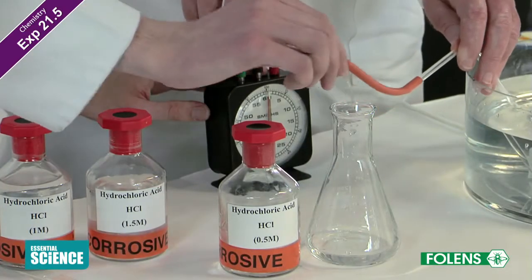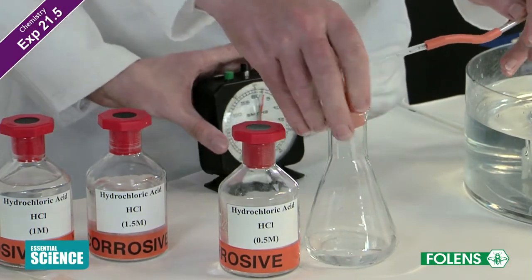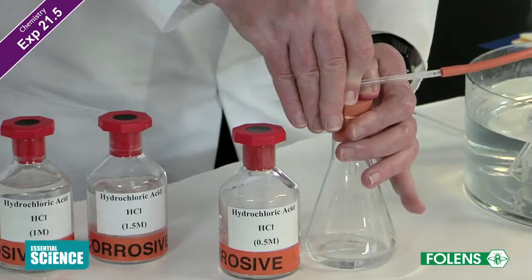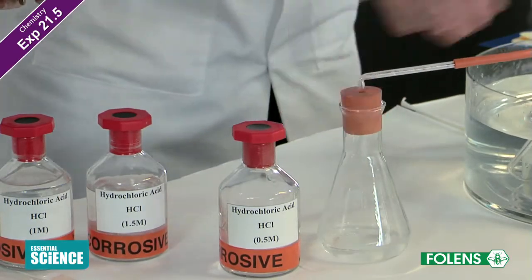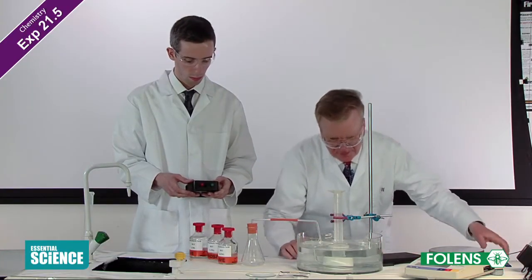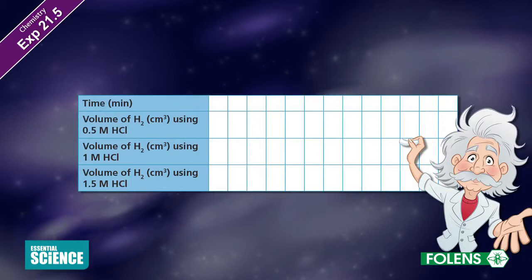Add the magnesium metal to the acid. Immediately place the stopper on the flask and immediately start the stop clock. Give the conical flask a brief, gentle shake. At regular intervals, for example every 30 seconds, record the volume of hydrogen given off. Use a table similar to that shown on the screen.